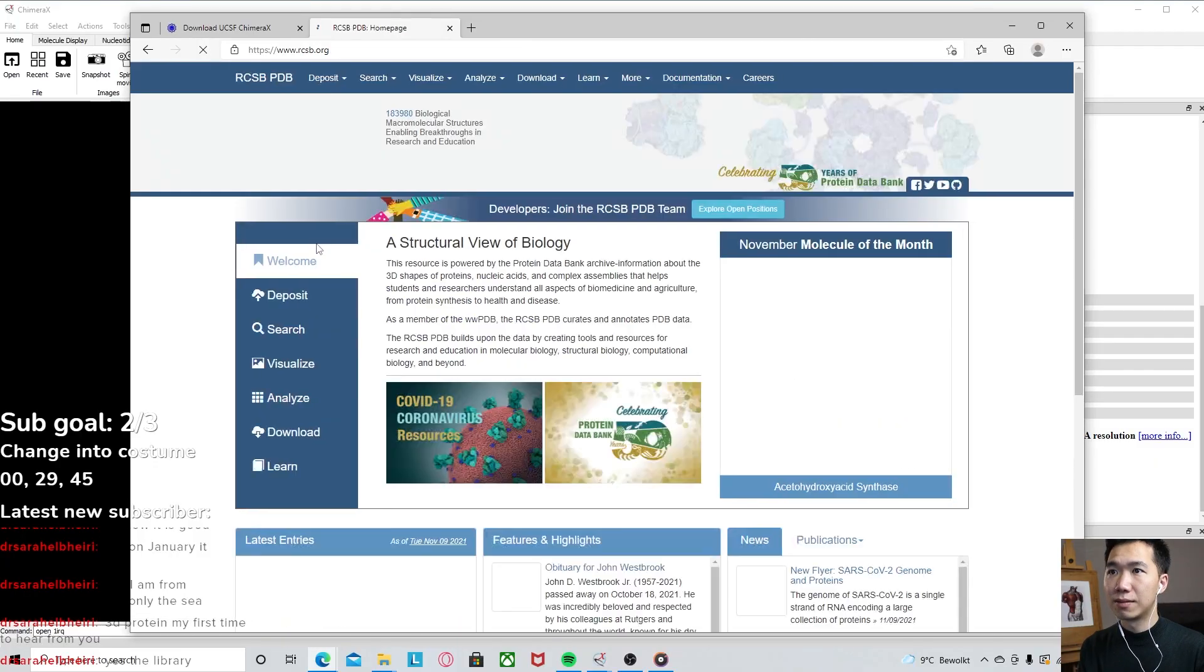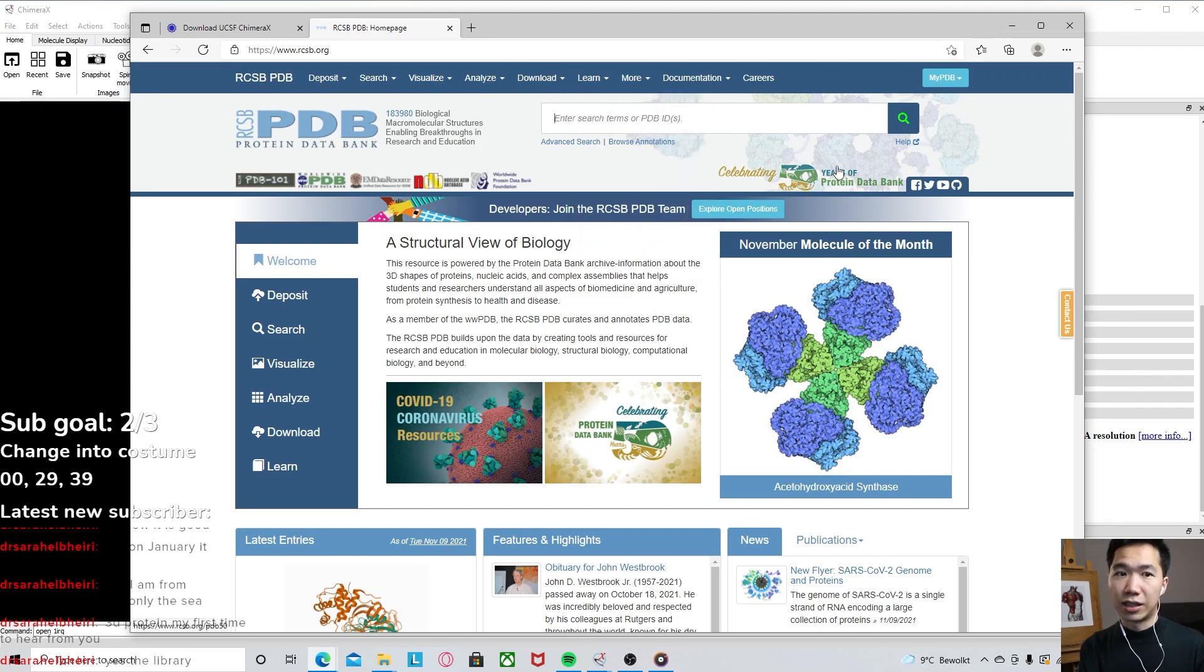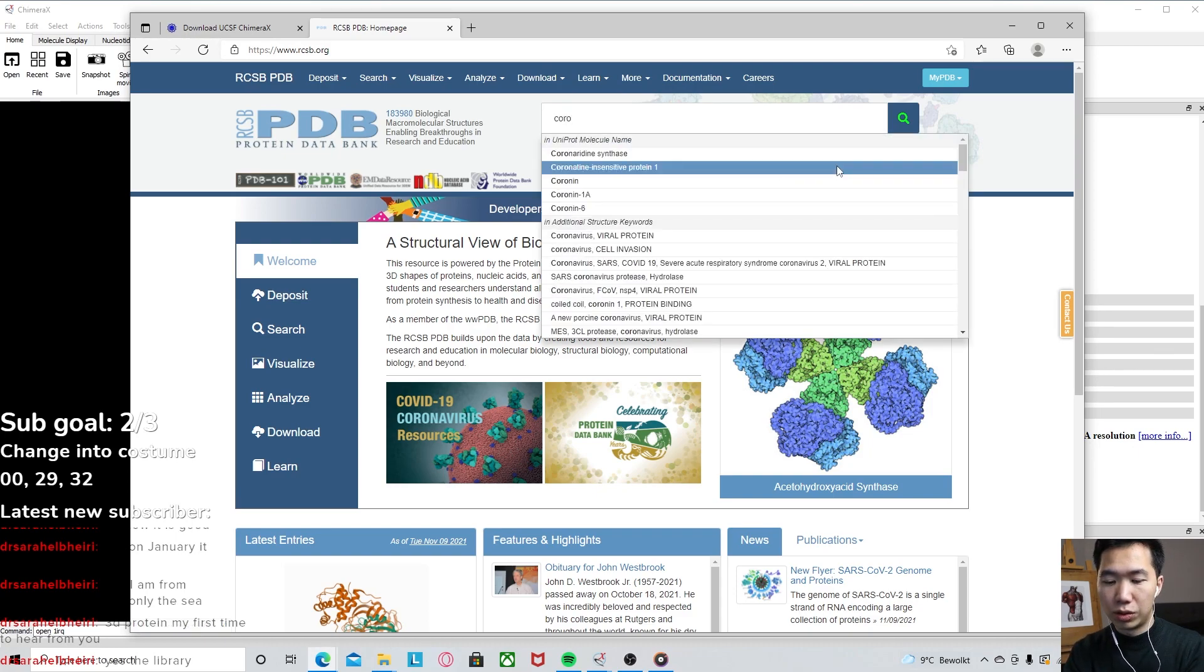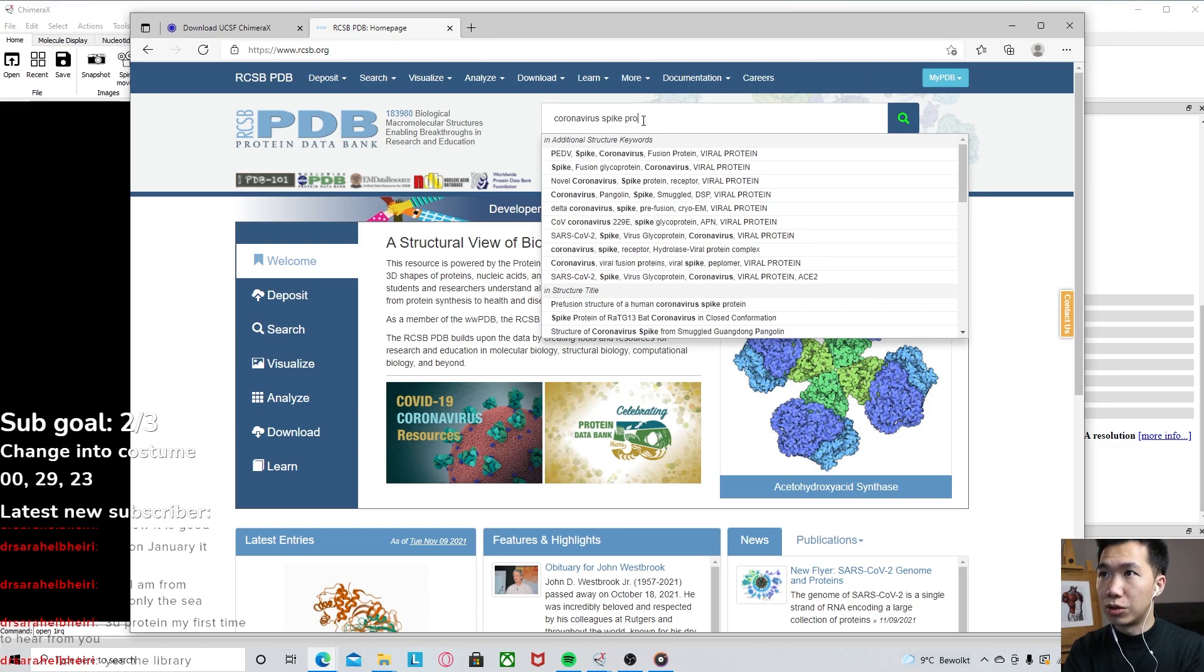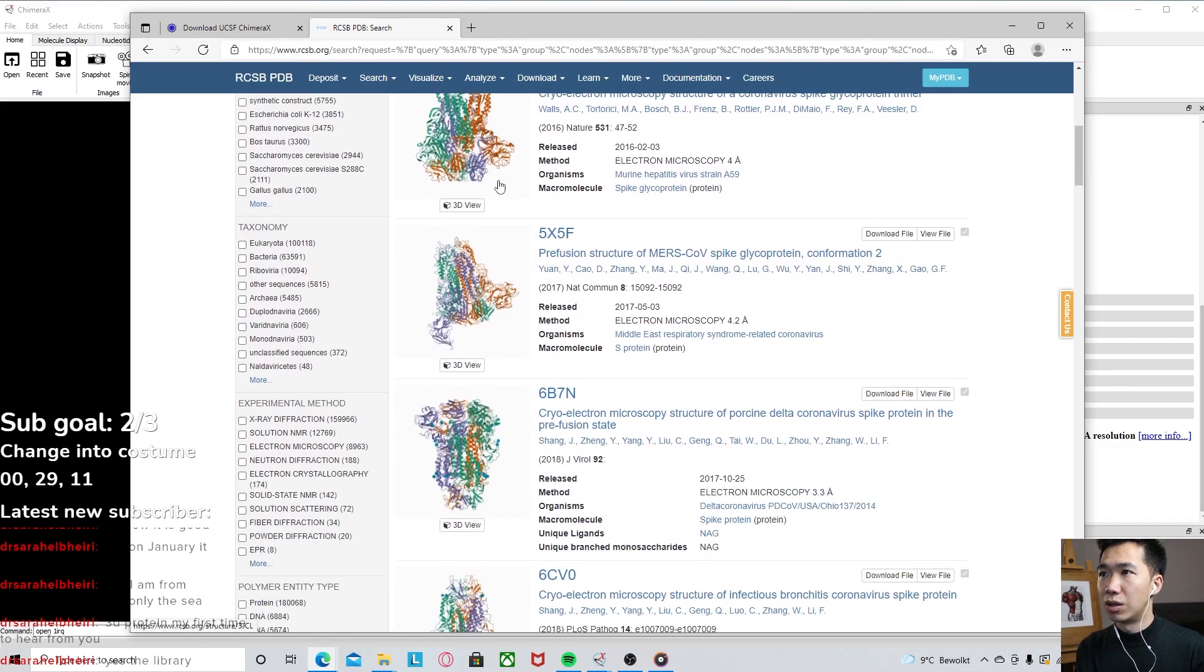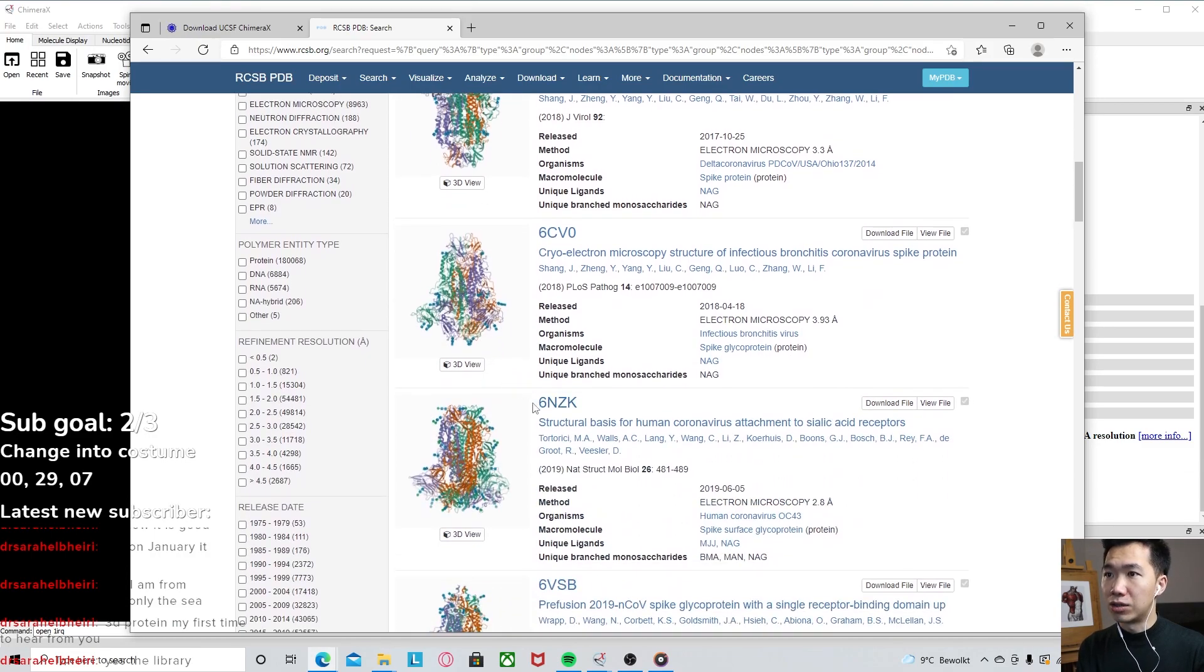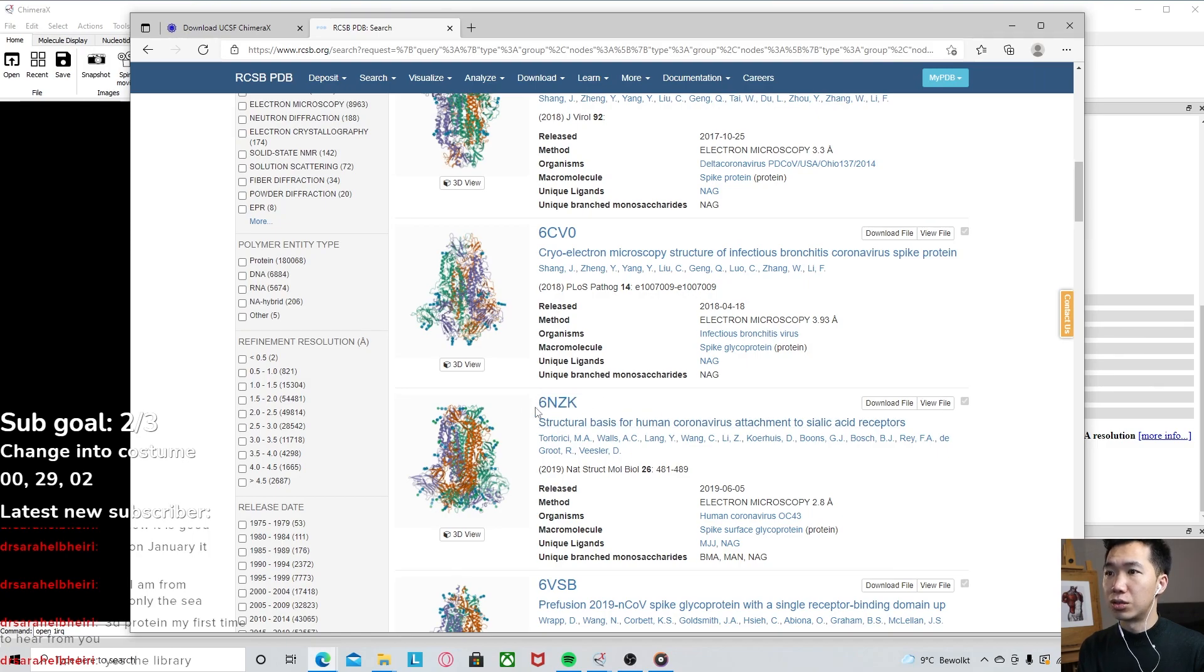RCSB PDB protein database. If you type in the protein that is your research topic, then you can find that four-digit code. For example, I type in coronavirus spike protein, you get all these different conformations of the spike protein. And you see they have this four-digit code over here. So you can use it to call out your protein in ChimeraX.